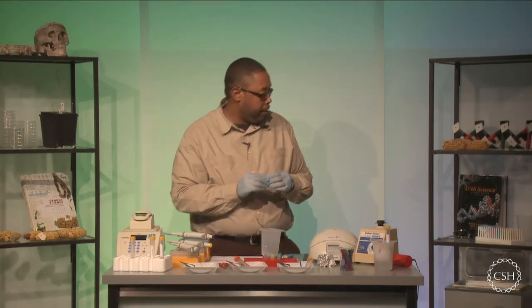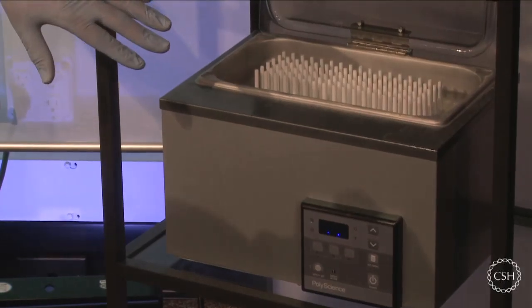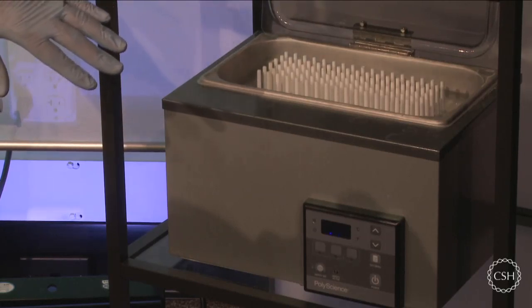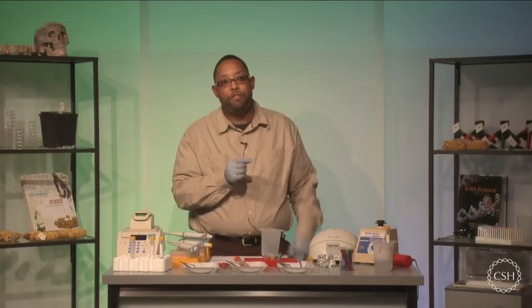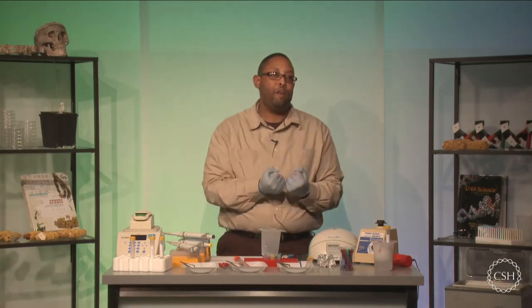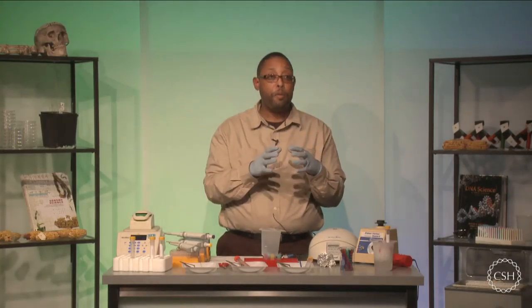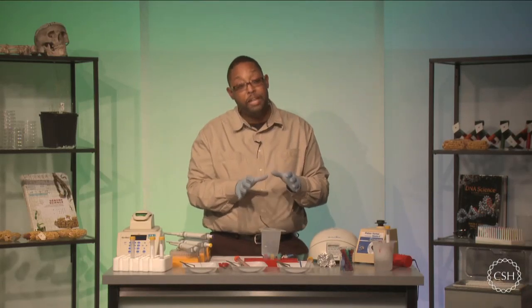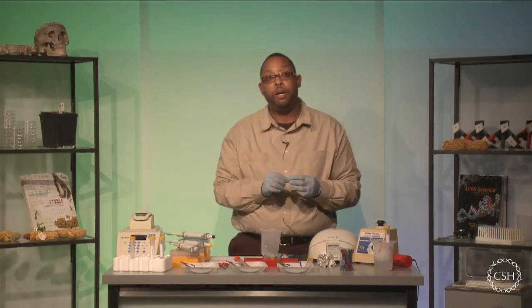Now, one other thing that I'm going to need, which is over here to my left, is an incubator, and there are 2 main temperatures that we're going to have to focus on. One will be 65 degrees Celsius, and that will be the first temperature we use. Then you'll have to have another water bath available at 57 degrees Celsius. If you don't have 2 water baths, give time for the first water bath to move down from 65 to 57 degrees Celsius so that you can have the proper incubation times throughout. If you leave your samples on ice, it's not going to make that much of a deal, or you can even leave them at room temperature. But please allow for the temperatures to get met before you do the main incubations.